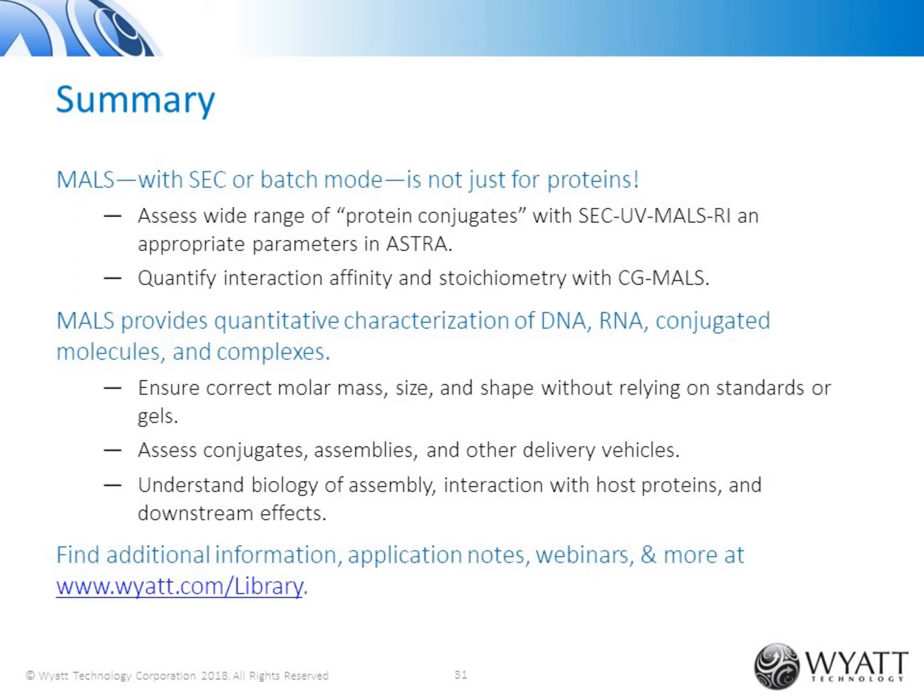Okay, thanks. Next question is, how can we measure the hydrodynamic radius of this DNA protein aggregation? Sure. So we use dynamic light scattering to measure the hydrodynamic radius typically. So within the Helios or Trios, within the light scattering detector, we can embed a dynamic light scattering detector. So we're simultaneously measuring the hydrodynamic radius with dynamic light scattering, as well as the molar mass with static light scattering. And so that can give you a size in addition to the molar mass.